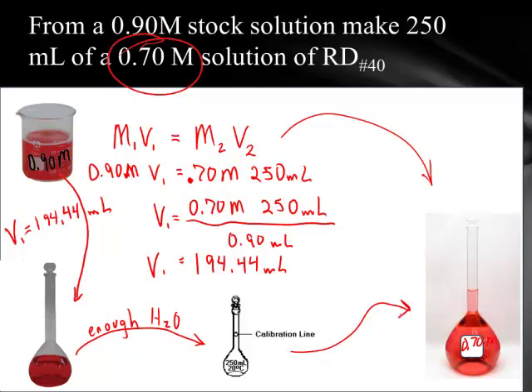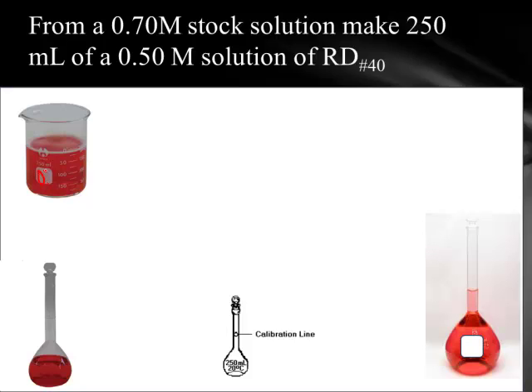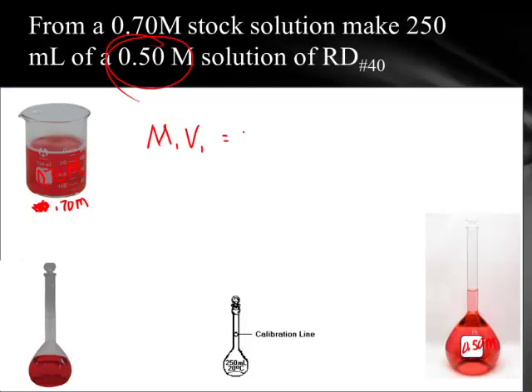Now let's look at one more example. In this one, I'm going to take this solution and pour it into this beaker. So I have here a 0.70 molar solution in this beaker. And I know that I want to make a 0.5 molar solution — that's what my next direction says — 0.5 moles per liter solution of red dye number 40. And I'm going to use this dilution equation: the concentration times the volume equals the concentration at the end times the volume at the end.